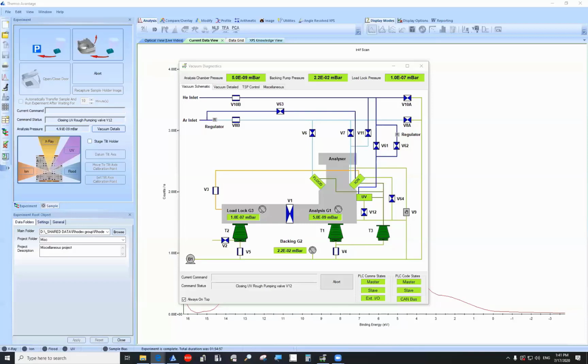Additionally, the samples and clips cannot extend past the end of the top plate, and all your samples should be approximately the same height to avoid source shadowing. We shouldn't have an issue there because we only loaded one sample.